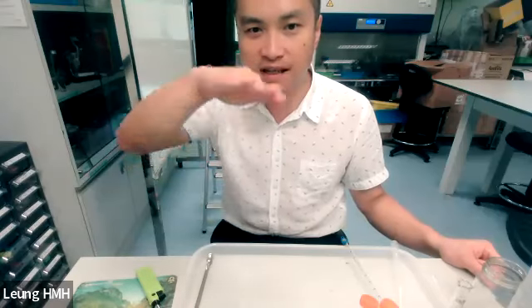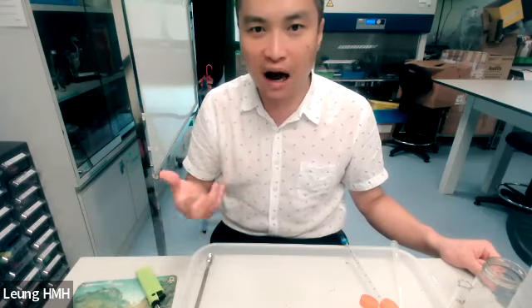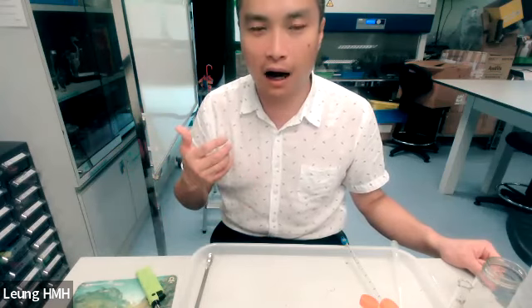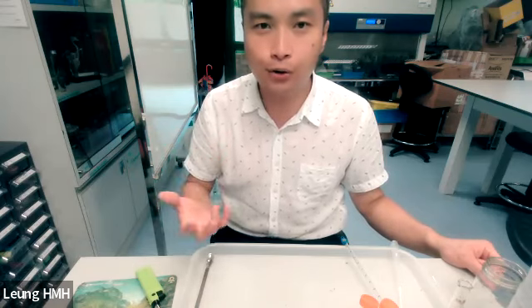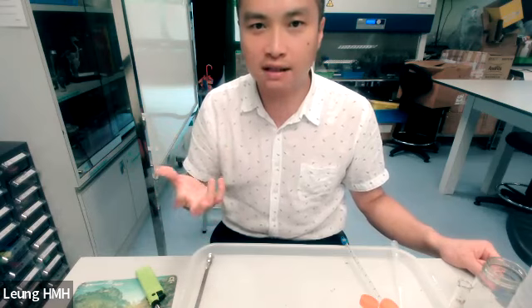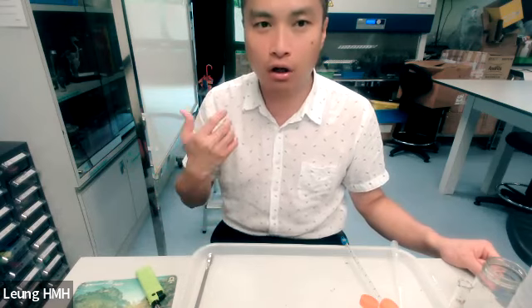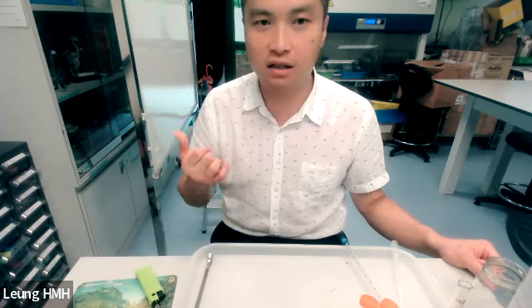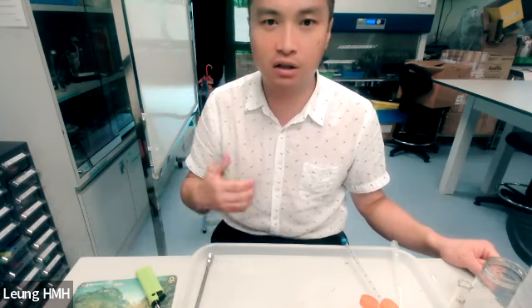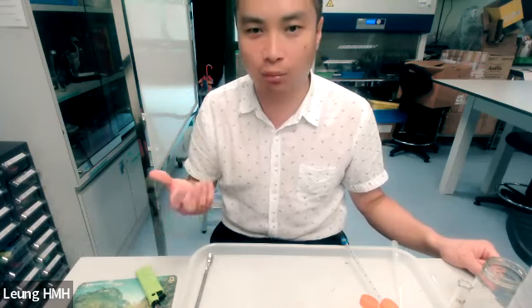The peak represents your target biodiesel found in the product. So this is the way for you to test the purity and also control the quality of biodiesel used commercially or for your own use.